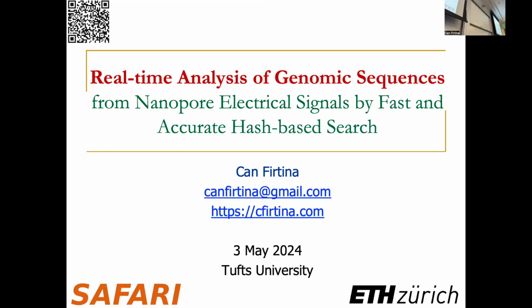Yeah. So base calling, given the right setup, would be more accurate. But what I mean by the right setup is the following. Base calling usually requires a large chunk of signal, which is usually larger than a chunk you receive within 1 second. It's usually around 2 to 3 seconds. Unless you get this, the base calling accuracy is actually pretty low. And there are works that show that the accuracy would be extremely low compared to these direct mapping approaches.